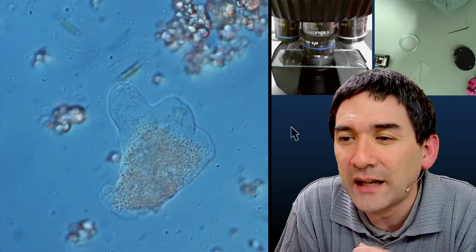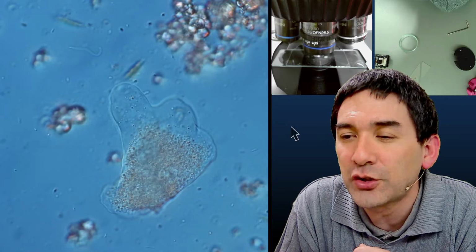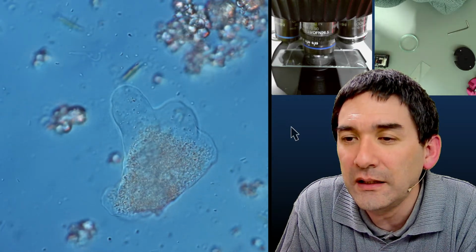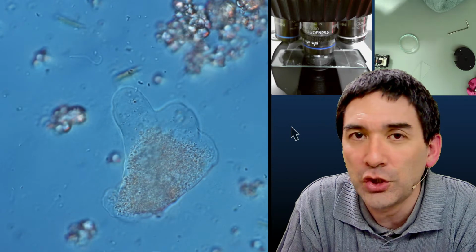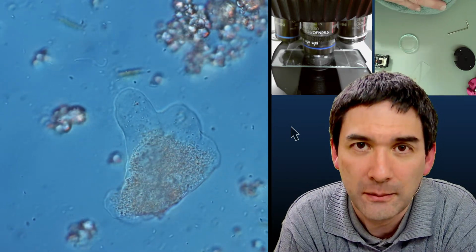Thoughts on focus stacking to get some really nice combined depth of field shots? Works well with hard sectioned plants. Yes, focus stacking. I have the following recommendation. There is a free program called Picolay.